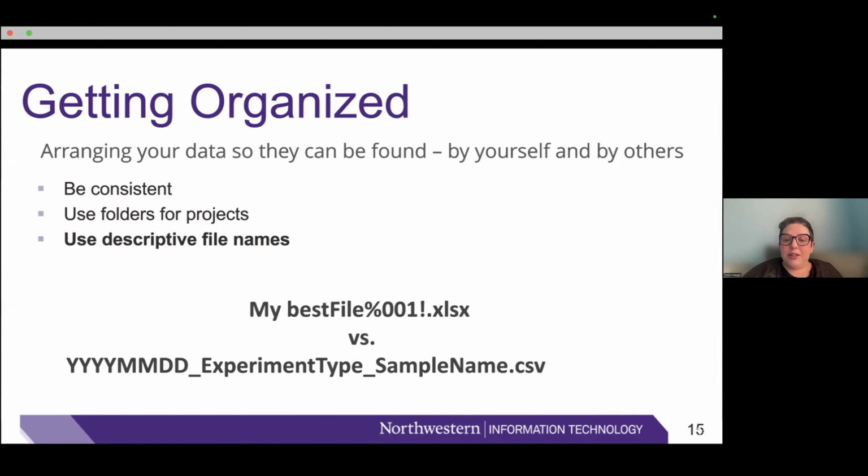So it's really good to pick a few attributes about whatever data file you're producing. Sometimes it's date, type of experiment, sample name, and then order them in your file name from most general to most specific so that you can actually use the sort function in your computer to make things sort in an order that's useful. So one example is date. I have year, month, and day. So if I sort it in my file browser on my computer, it's sorted in chronological order.